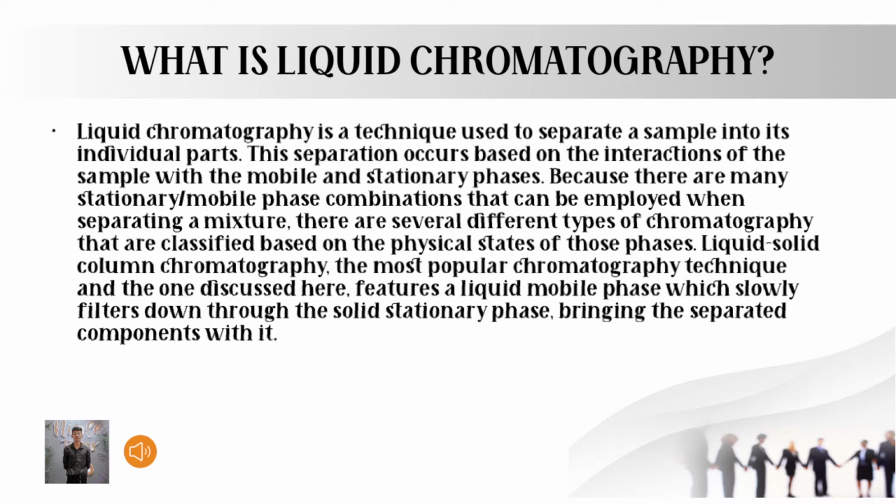What is liquid chromatography? Liquid chromatography is a technique used to separate a sample into its individual parts. This separation occurs based on the interaction of the sample with the mobile and stationary phases. Because there are many stationary or mobile phase combinations that can be employed when separating a mixture, there are several different types of chromatography that are classified based on the physical states of those phases.